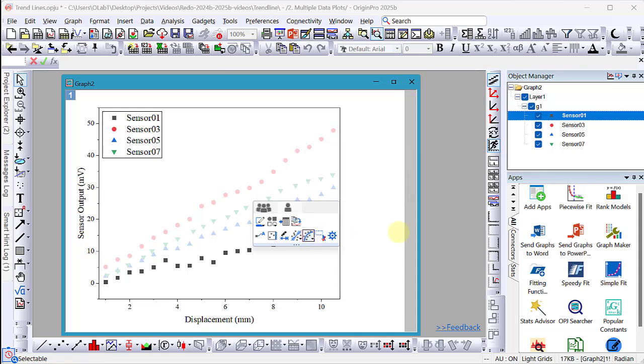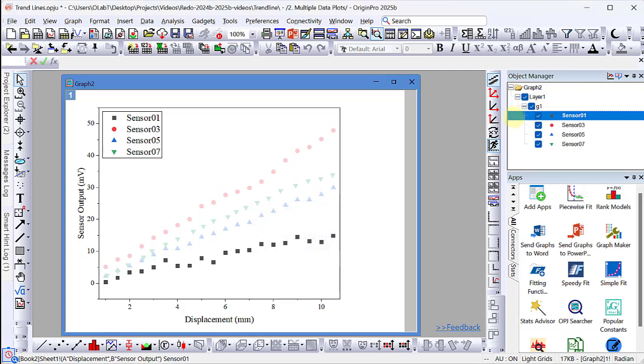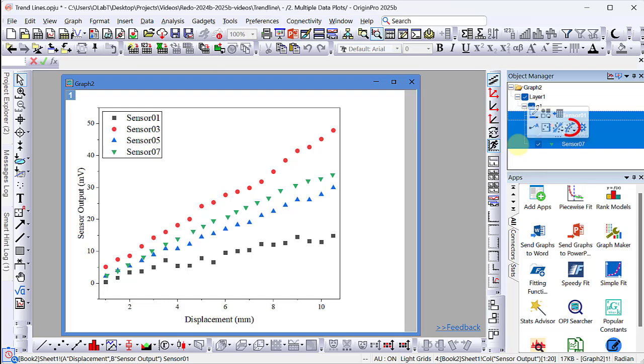A better approach is to use the object manager panel. Hold the shift key and select all data plots. A mini toolbar pops up and the trend line button is now available. Click it to add trend lines for all selected plots.